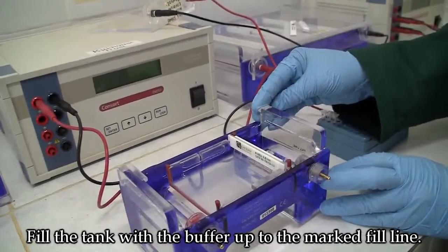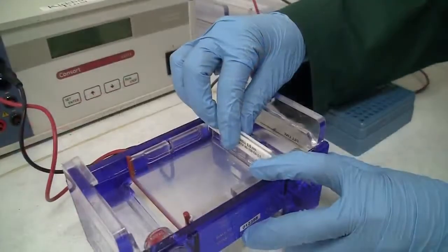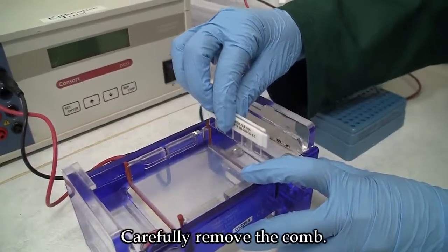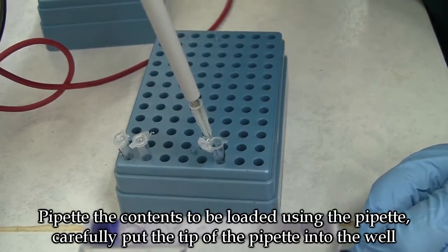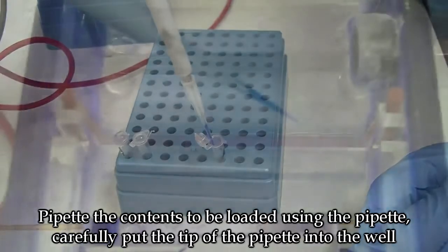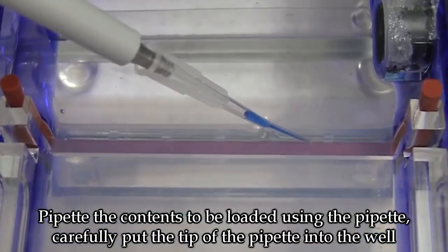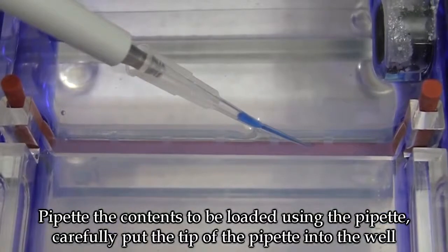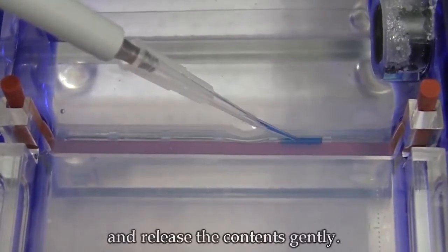Fill the tank with the buffer up to the marked fill line. Remove the comb. Pipette the contents to be loaded and carefully put the tip of the pipette in the well and release the contents gently.